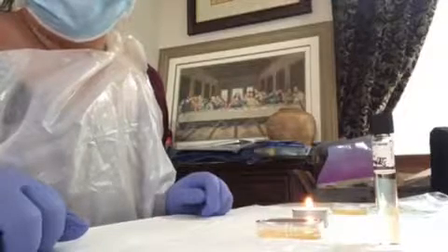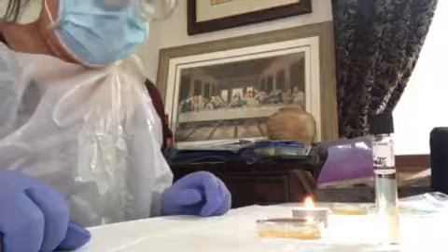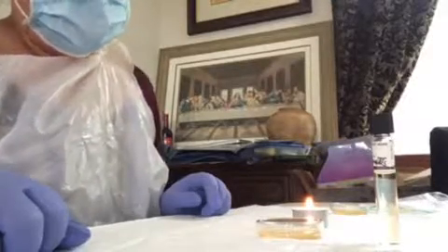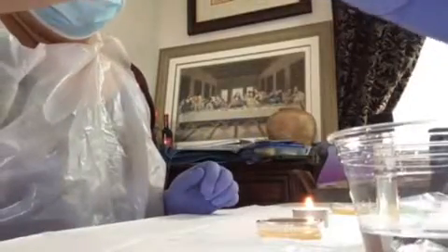This is for bacterial identification through functional media, motility testing. So I will be doing this on the S. epidermidis, and I already soaked the paperclip in alcohol for a couple of minutes. So it's ready to be used. Okay, so let's get started.